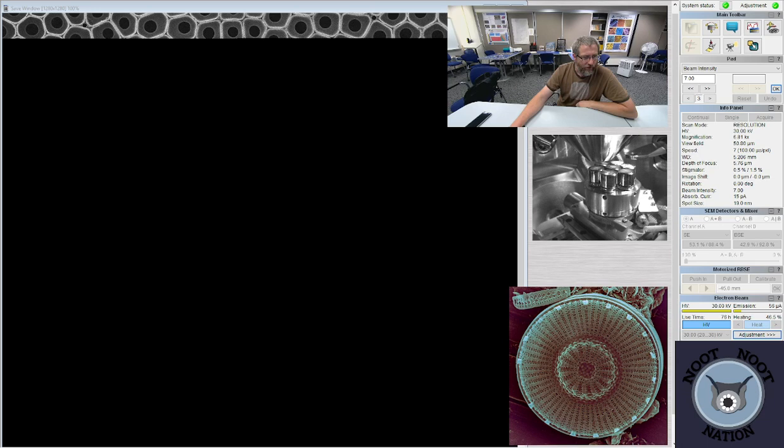Okay, let's see. Fibonacci spirals. How much of the world is formed by the corpses of diatoms? A pretty small fraction, Bill. They're silt-sized particles, and they dissolve a lot of times before they reach the bottom of the ocean.